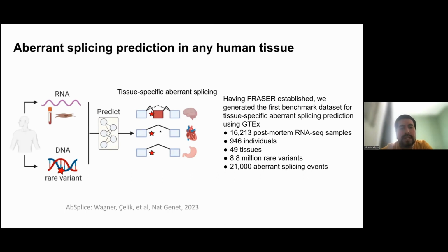So what we designed are these so-called splice maps, where we say that if there's a variant here in the intron but there's no exon here, like in the stomach and in the heart, it should be fine. But because there's an exon here in the brain, it will impact the brain, but not the other two organs. That was the main reasoning.